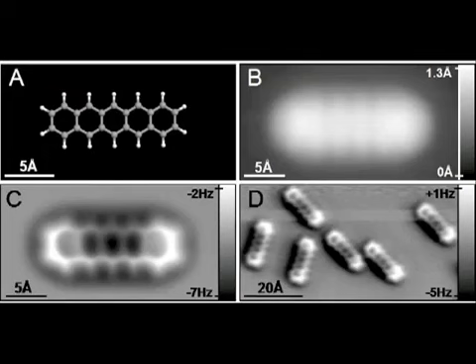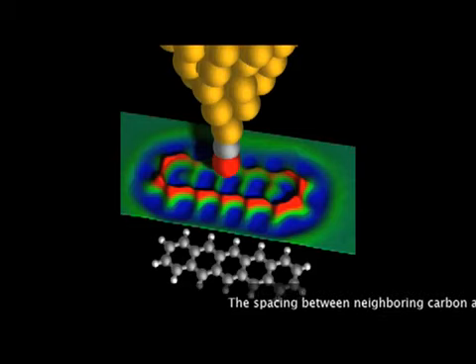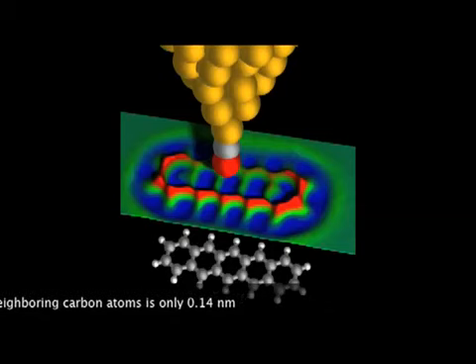While not a direct technological comparison, this is reminiscent to X-rays that enable the imaging of the bones and organs in the interior of the human body. To achieve this, as illustrated in this graphic with experimental data, IBM scientists used an atomically sharp metal tip terminated with a carbon monoxide molecule. This enabled them to measure the short-range regime of forces and image the inner structure of the molecule.